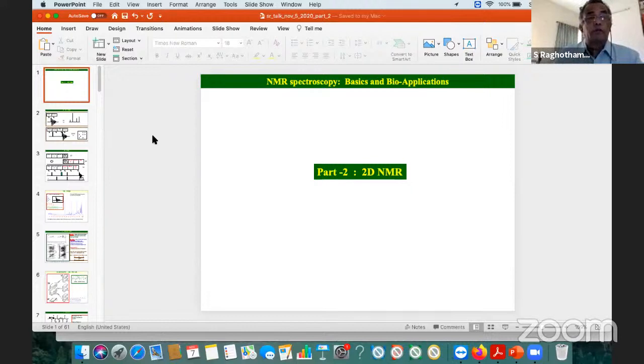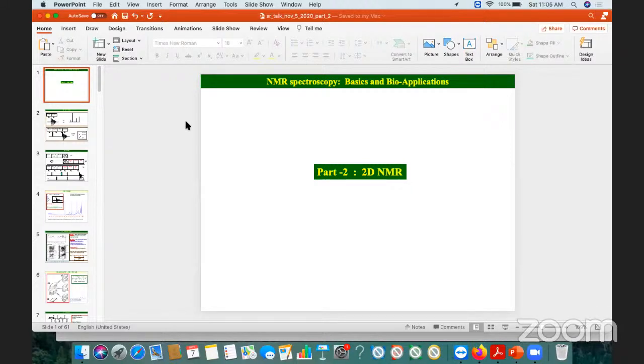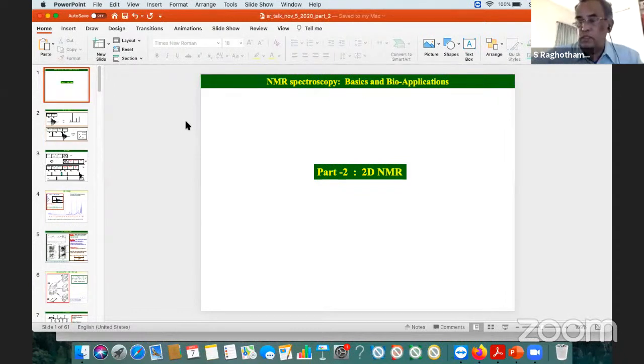Good morning, everyone. We come to the final session of this web series. In the last 2 days we learned some basics of NMR and useful parameters in them. And now today I'll be telling a little more about two-dimensional NMR and how all these things are helpful for getting structures or the characterization of chemical molecules. Today I mainly concentrate on the introduction to 2D NMR.